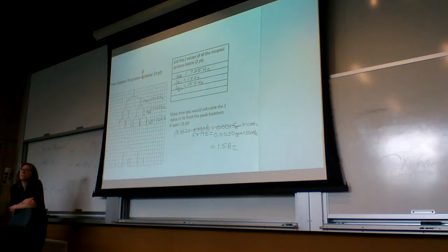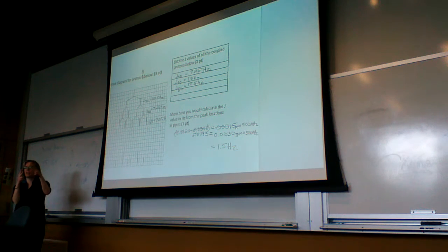Does that say JAB twice? I just can't read it, sorry. Yes, because there were two neighbors. One was 2A, right? And so one of them is going to split it once, and then the next one splits it a second time, but those are equal values.